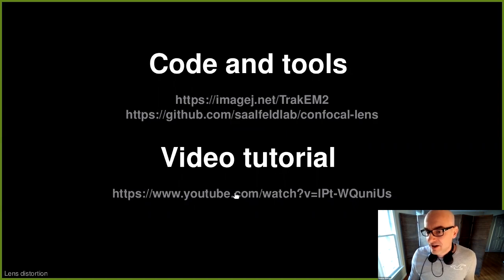And then there is this very long and extremely boring YouTube tutorial where you can watch me slowly grinding through all this stuff and calibrating a camera for FlyLight. So for one scope with 5 color channels. And it's very easy to reproduce. And yeah, so if you have interest in that and want to try it, then please do it. And if there are questions, you can always get back to me.